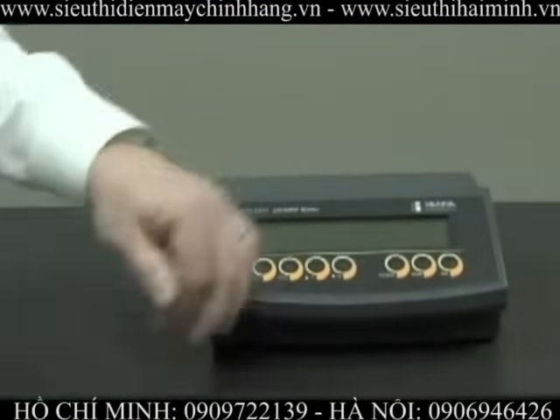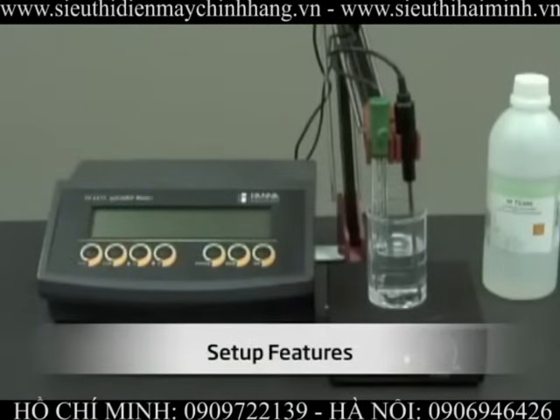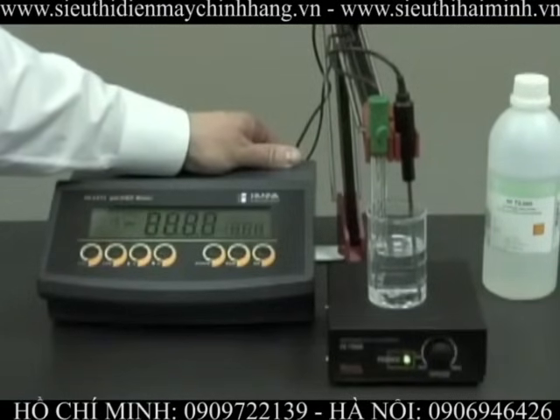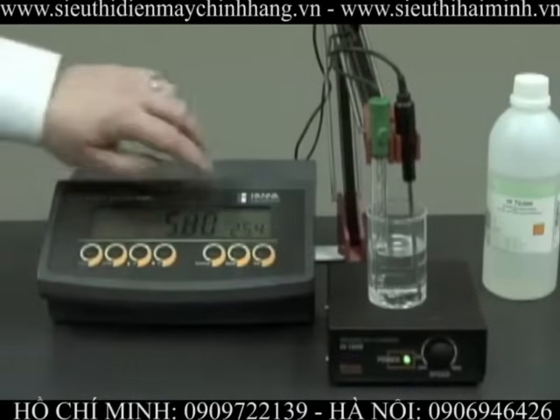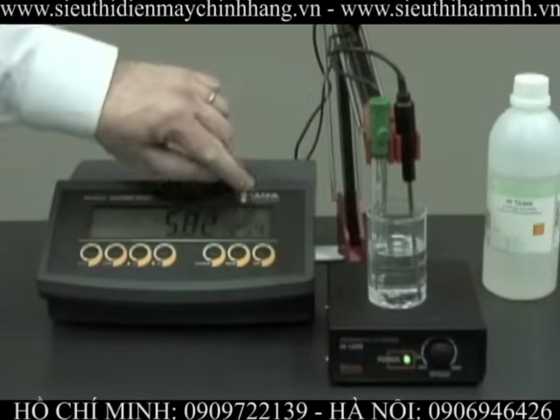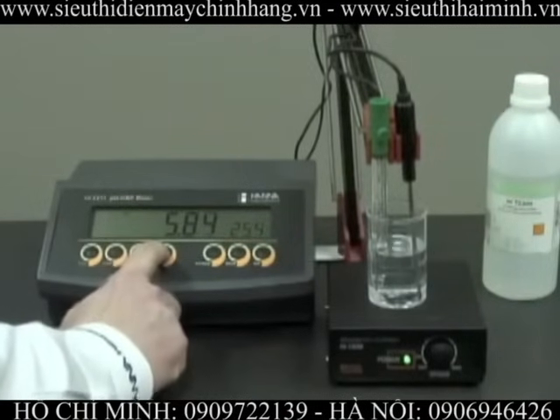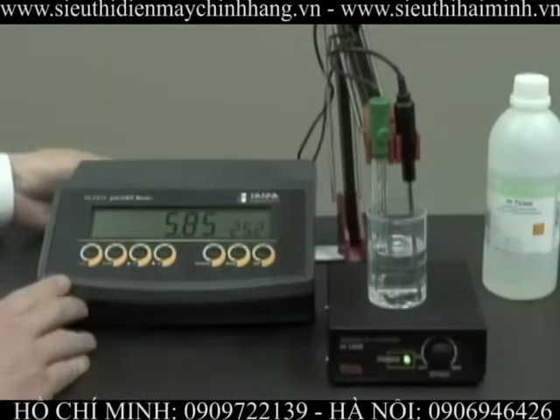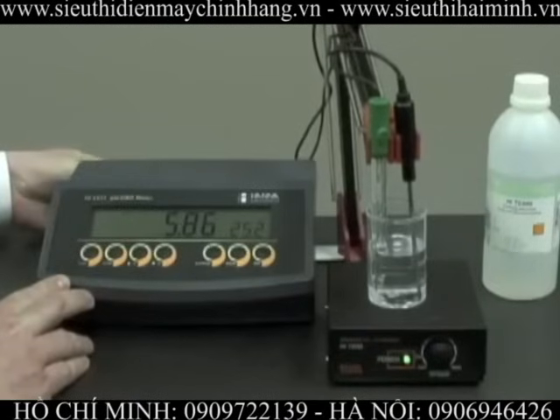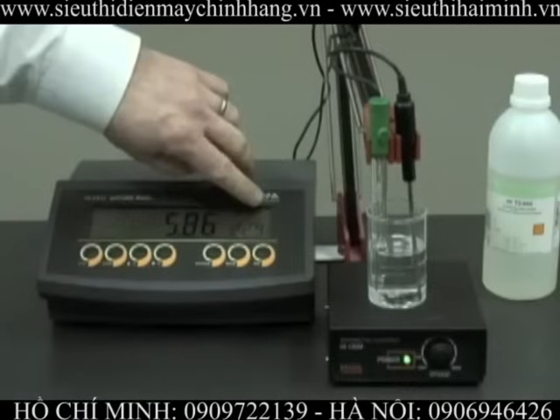Now I'd like to turn this unit on for you. We've connected the probes to the meter and we're ready to turn the unit on. At the moment, we're in manual temperature compensation mode — you can see the flashing C. In this mode, we can increase or decrease the temperature as necessary. When we connect the temperature probe, it automatically turns to automatic temperature compensation, and the C is no longer flashing.